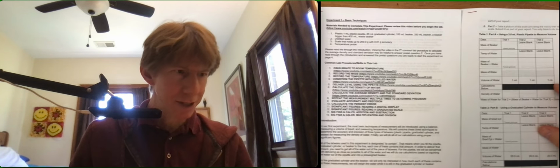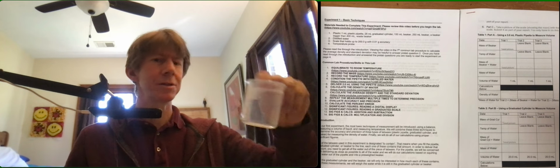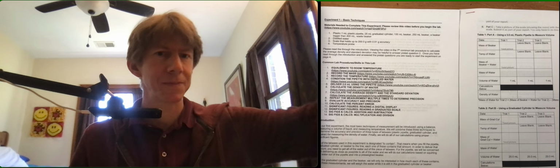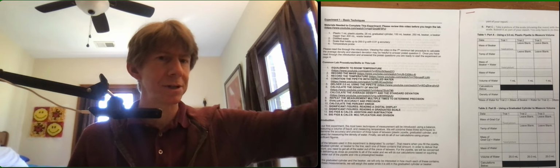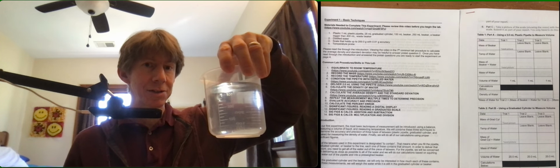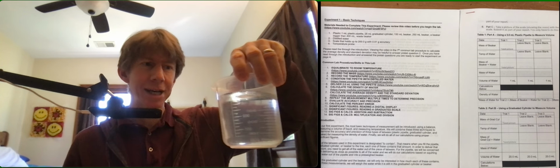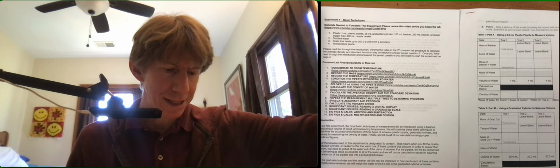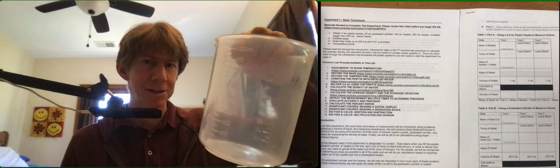Let's see, a 100 mL beaker, a 250 mL beaker, right there. A beaker bigger than 400 mL, mine's 500 mL, and it's already got my water, which I've already had sitting out here for 15 plus minutes. And a waste beaker, just a big waste beaker. Distilled water, I already showed you that.